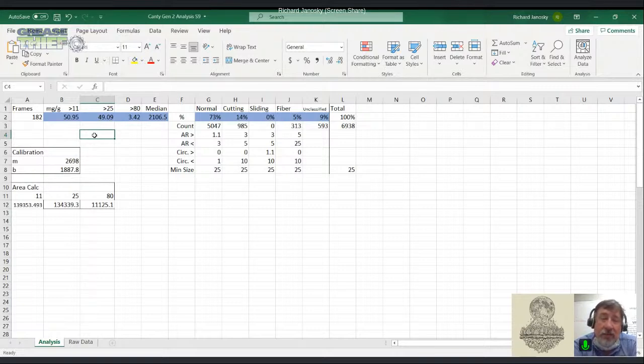And I think these percentages look small. We say, well, it's 73% normal particles. I think this perception comes from the world of analytical ferrography. But keep in mind, there's no separation of the particles. This is just their normal distribution within the grease. When we think about oil analysis, we're concentrating the particles together, often concentrating the larger particles for inspection, especially with analytical ferrography, and to a certain extent with micropatch microscopy. But here, this is everything. And so it's quite common that most of the particles should be what we would classify as normal.